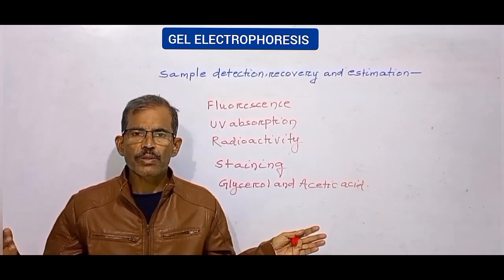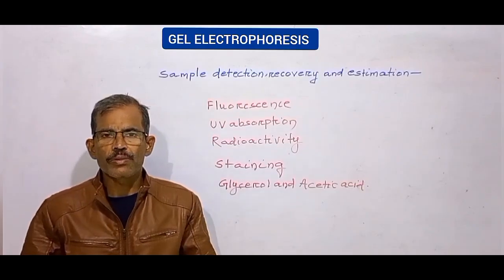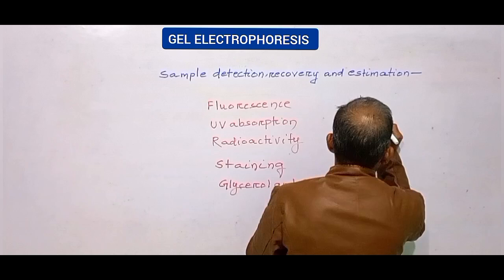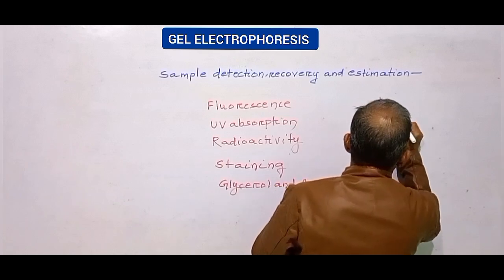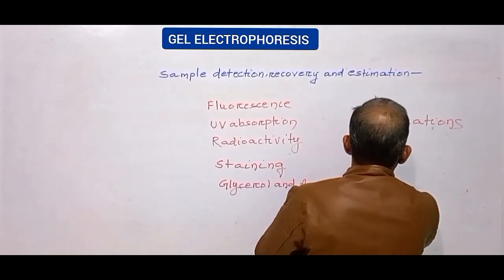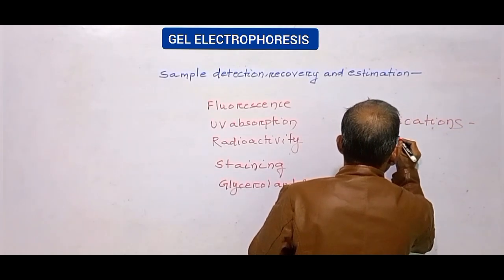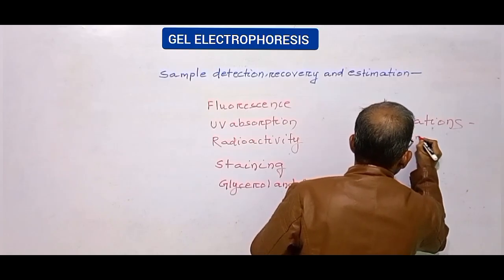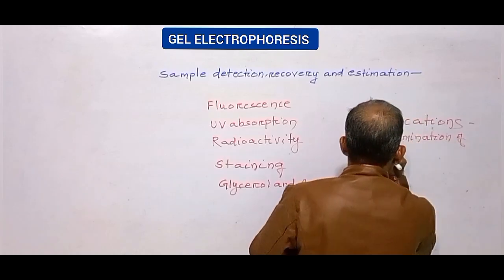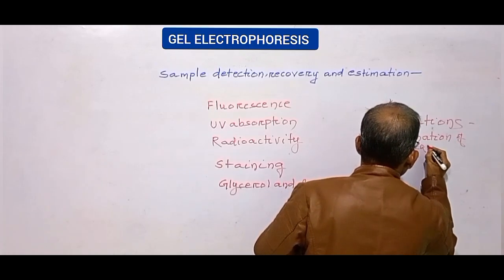Apart from the separation of proteins and many other macromolecules, gel electrophoresis has several other applications. First one is determination of DNA sequence.